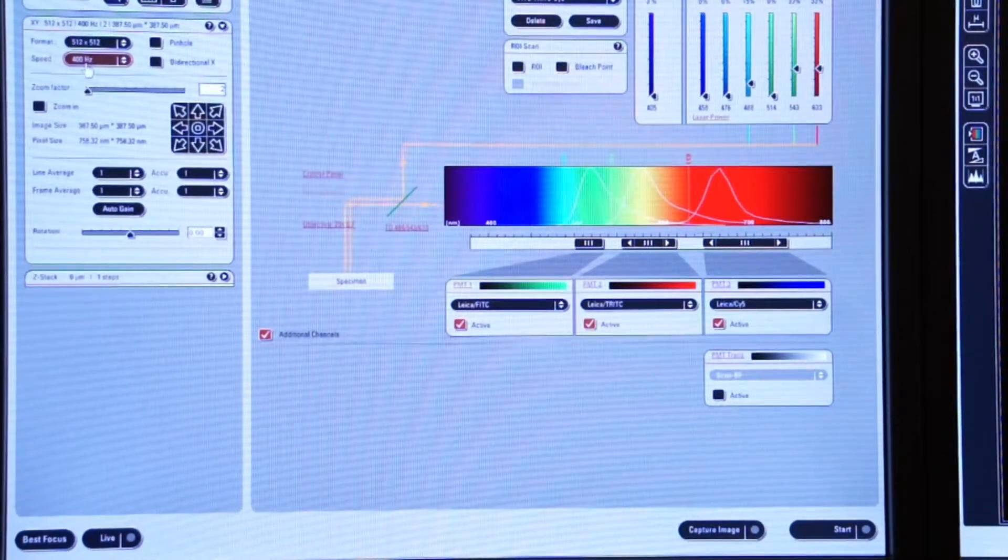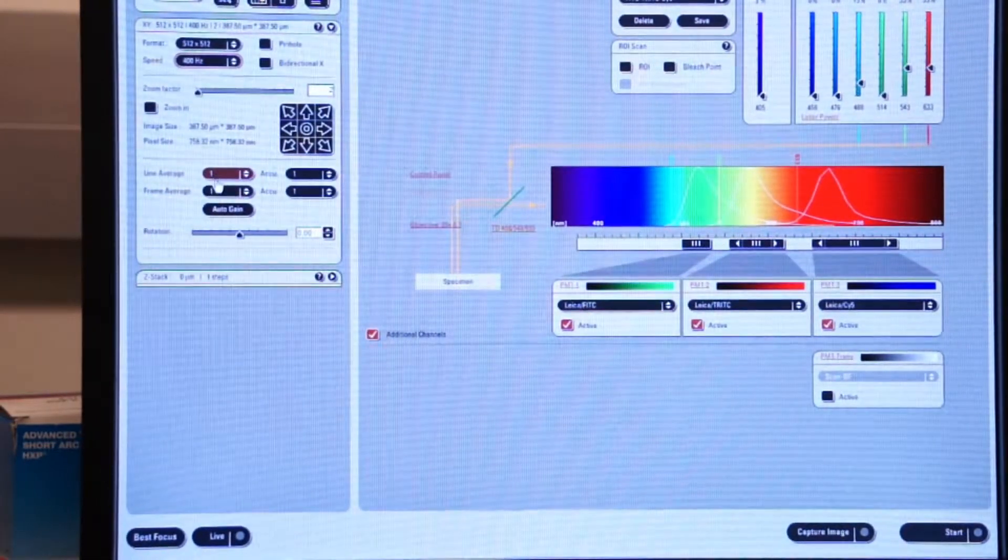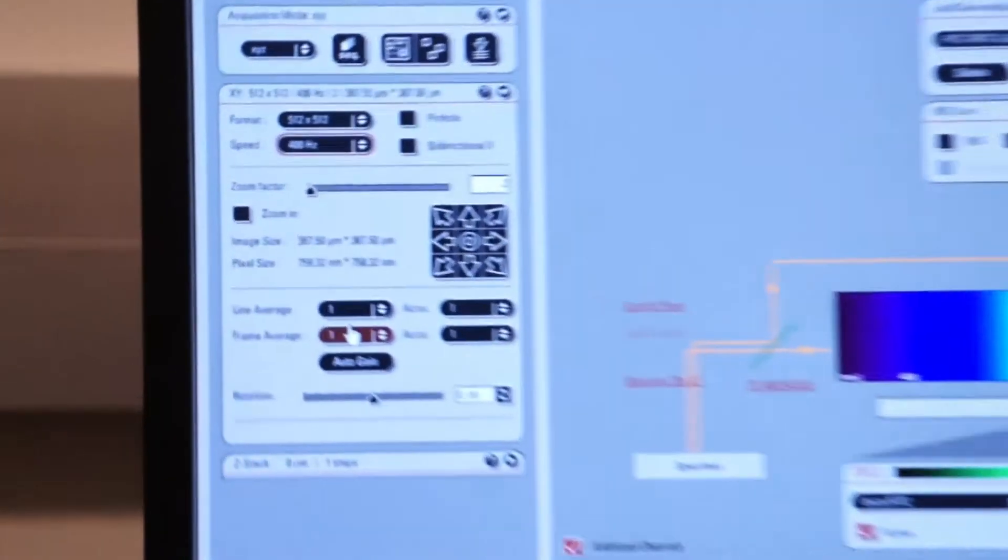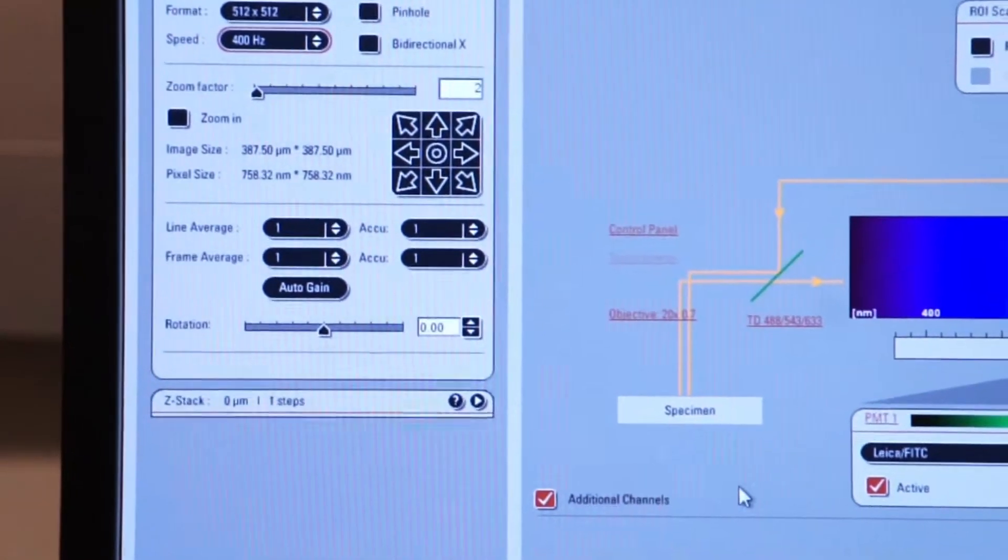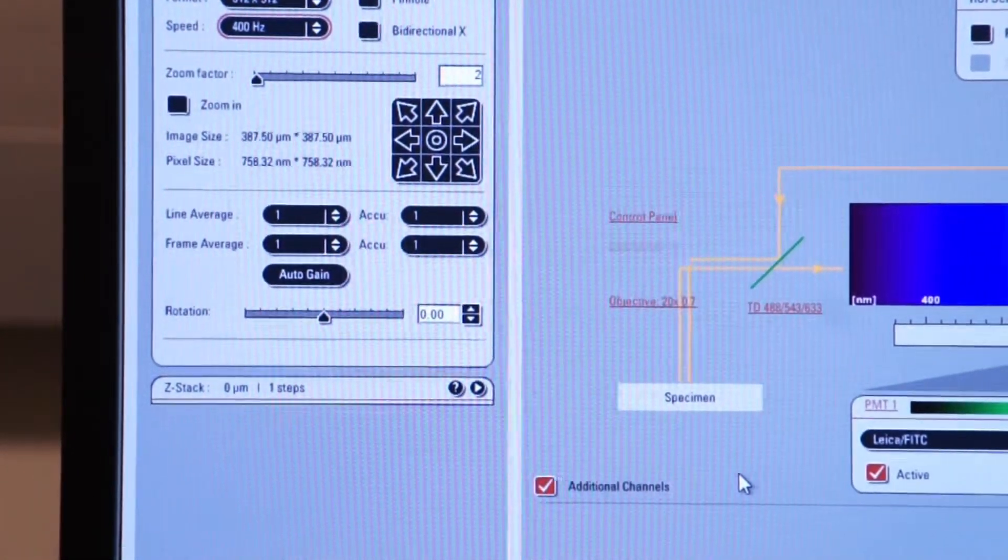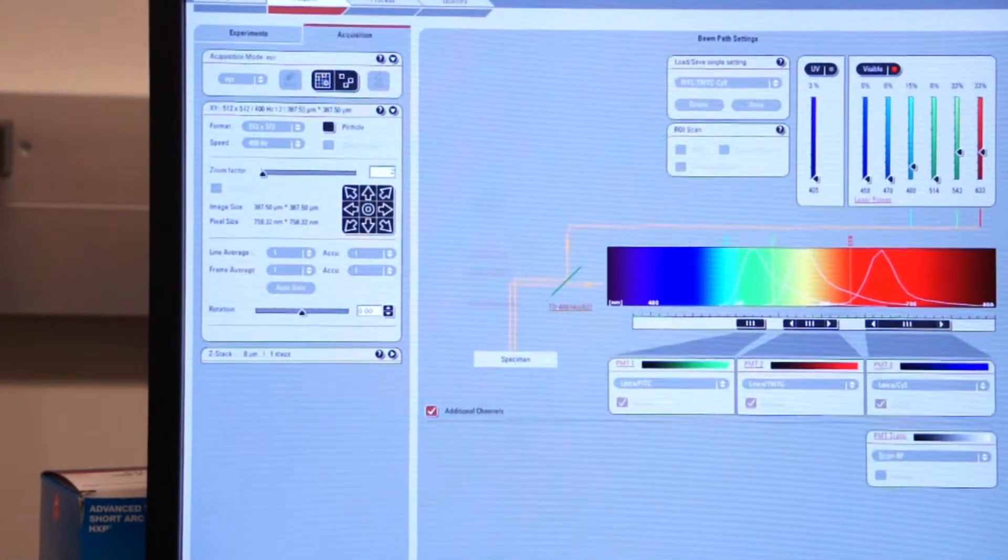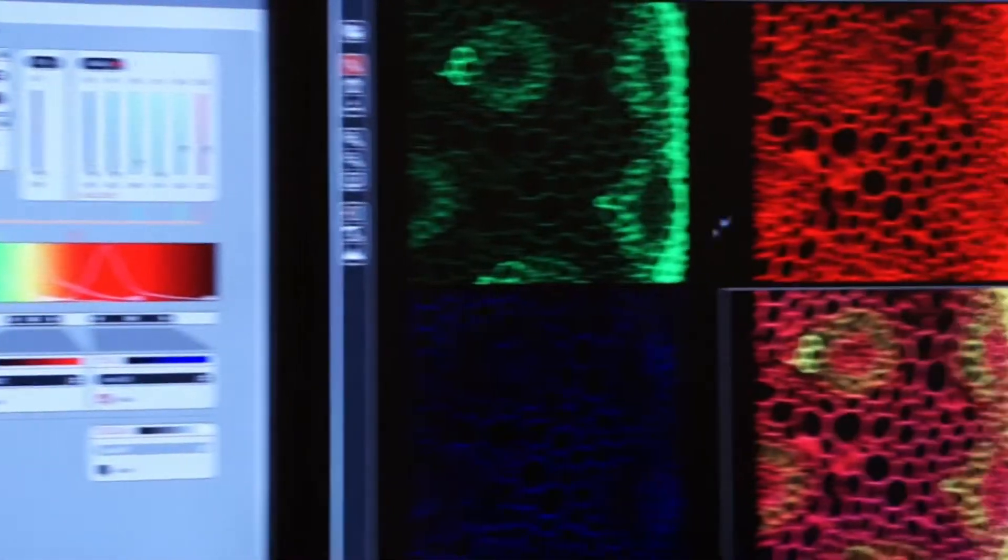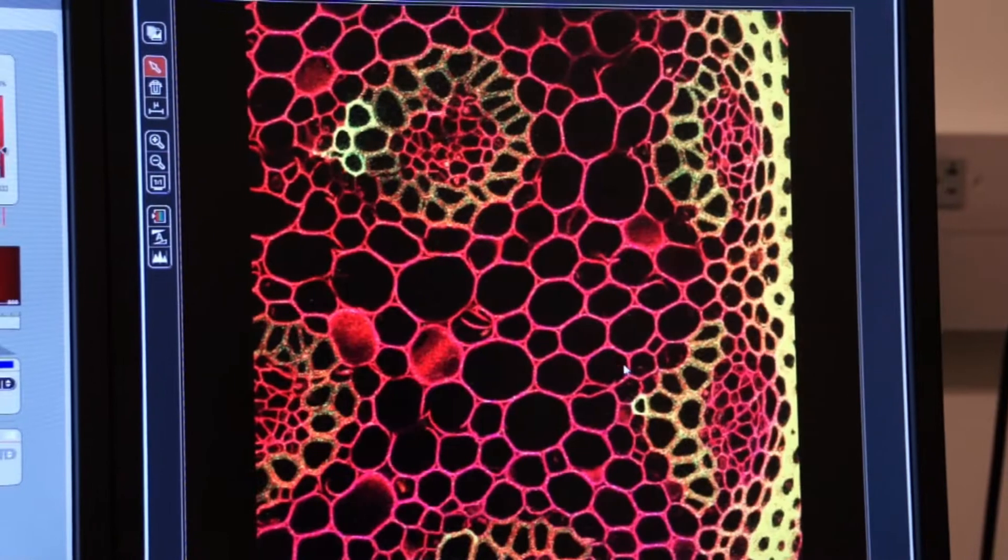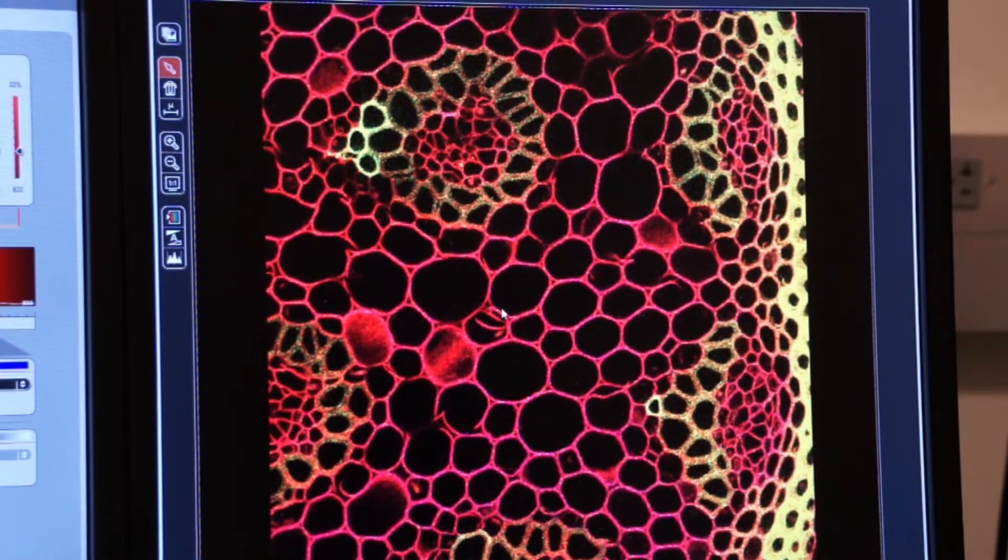Our speed is at 400 Hertz and we have not engaged any line or frame averaging. We'll go down and click on capture an image and let's capture an image of our specimen. Here you see all three of our fluorophores and our composite image.